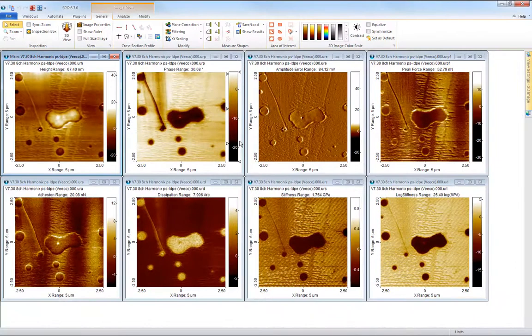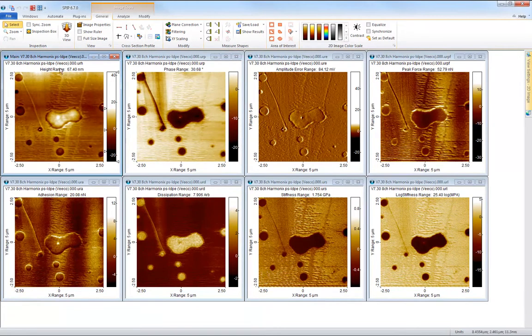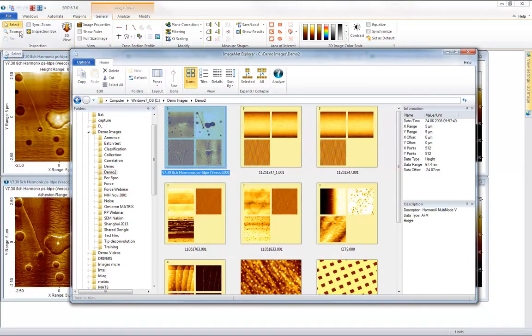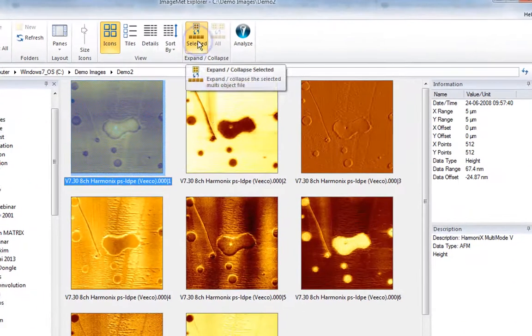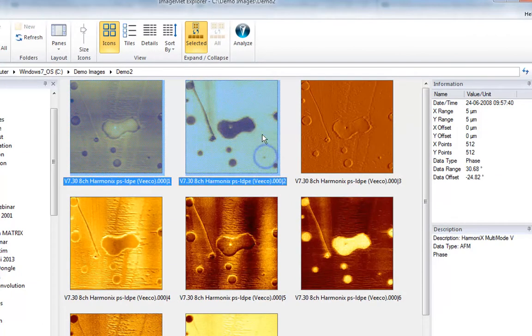When an image file is opened in SPIP each channel is usually displayed in separate windows side by side. When using the ImageMed Explorer browser it is possible to select which channels to open. In this case we just open the height and phase channels.